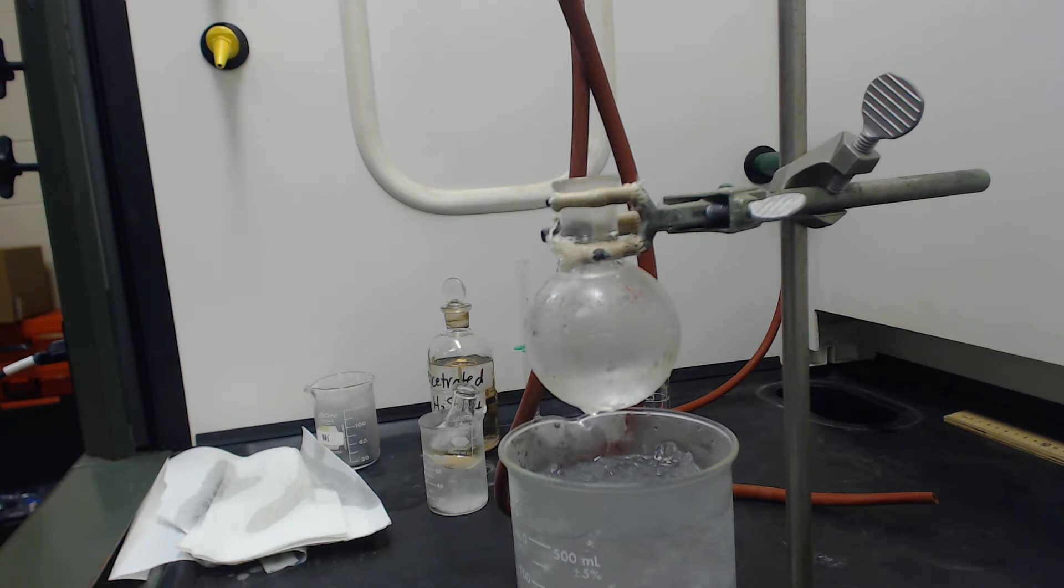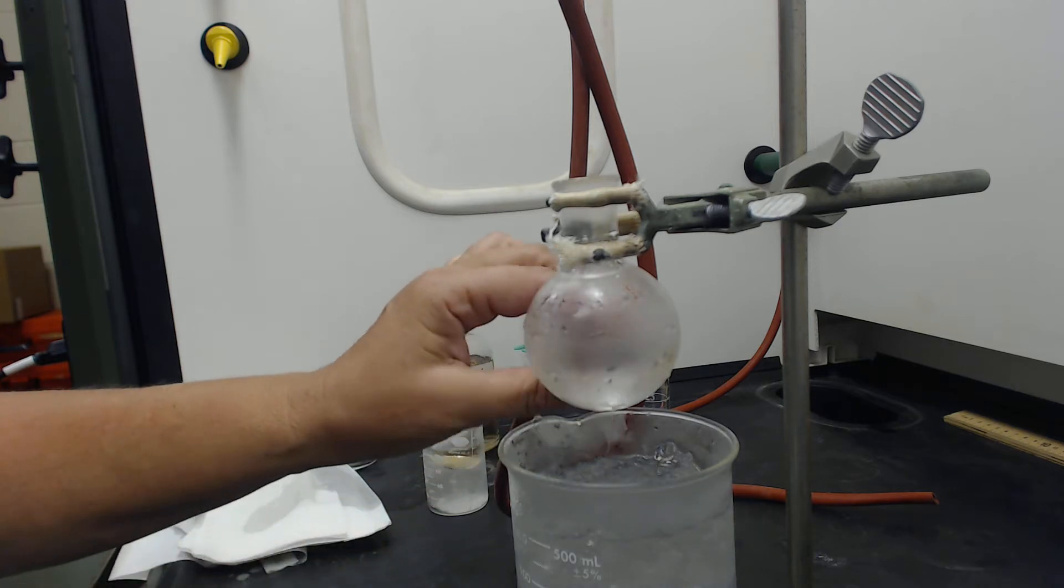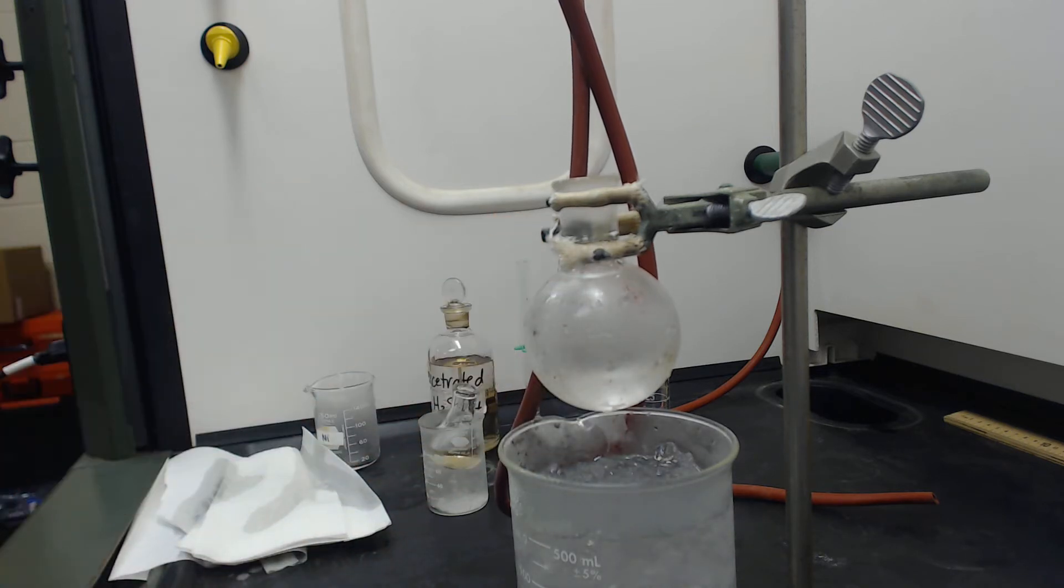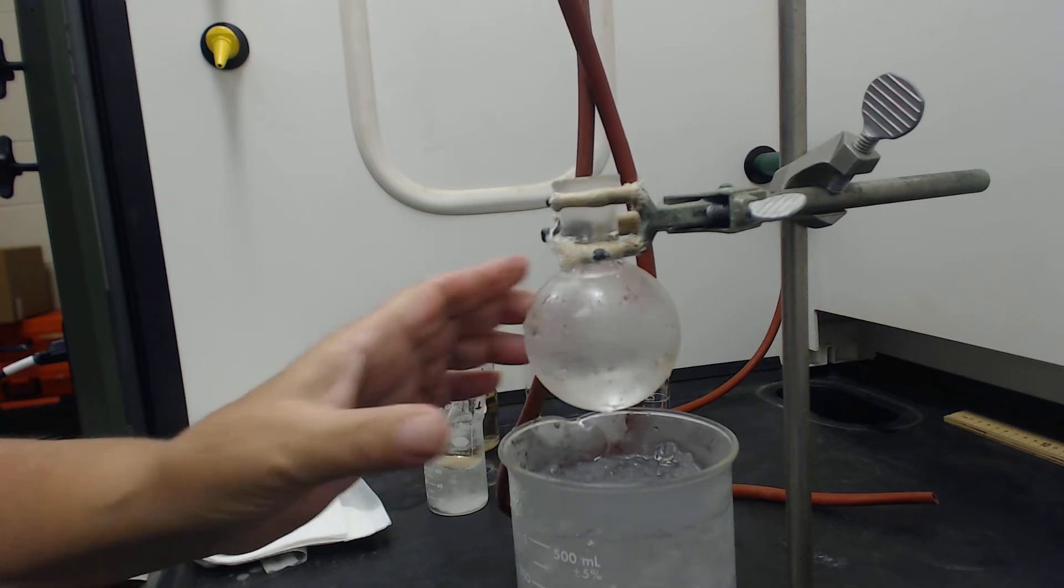We are going to be using the second preparation method in the introduction. I've already kind of started. I've already added 12 grams of sodium bromide into this flask and I've added 12 mL of water.